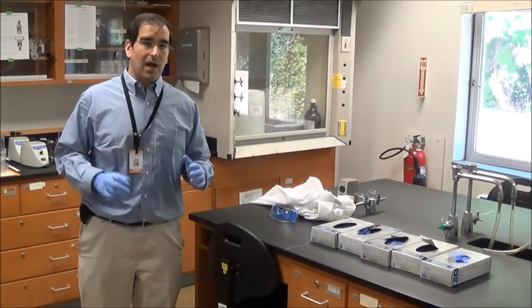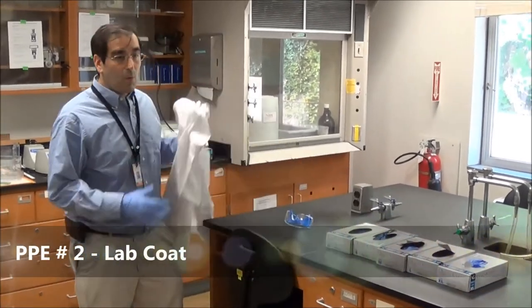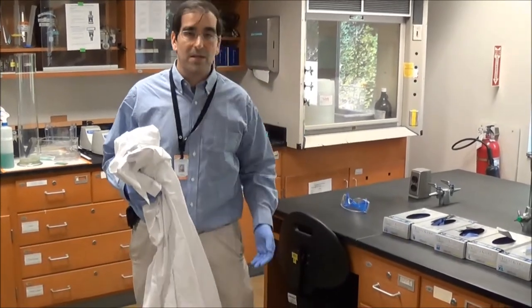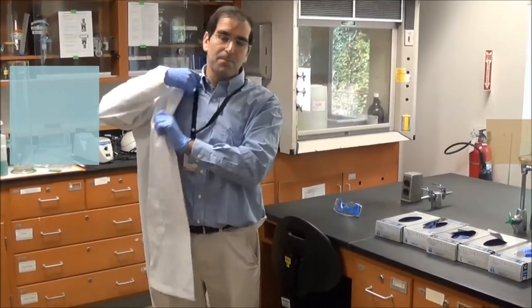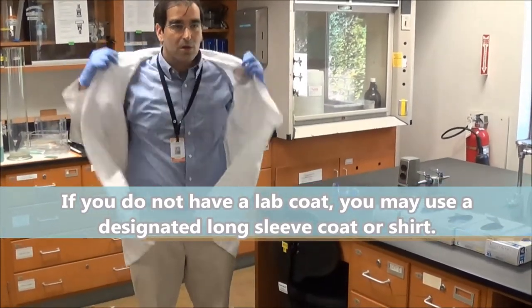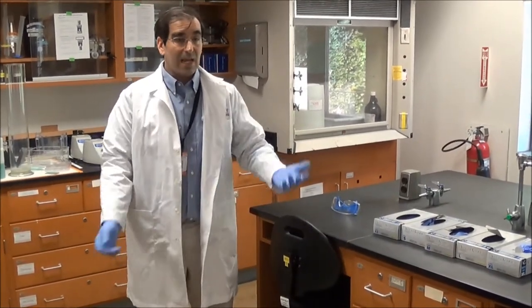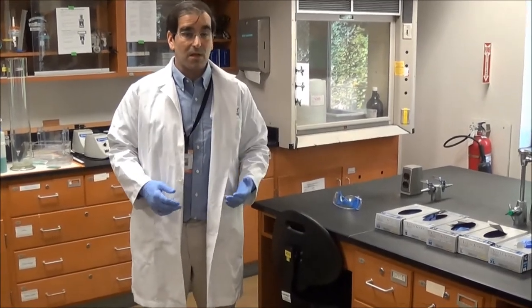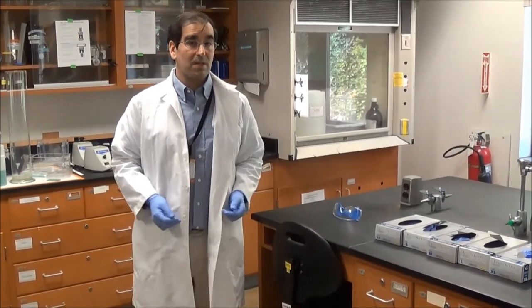The second item of personal protective equipment is your lab coat. You might say, 'I have long sleeves and long pants on — I'm covered.' But the lab coat serves two functions: it not only protects you personally, but it protects your clothing as well. You might have worn a very nice outfit to the lab and you don't want stains like bromophenol blue or Gram stain material to get on that clothing. By putting on a lab coat, you've protected both yourself and what you're wearing.